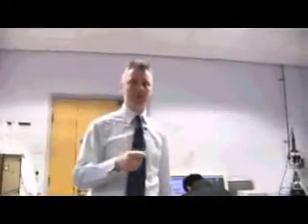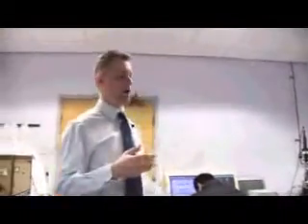Okay. Where are we now? So basically in one of our atomic force microscopy labs, and this is a special tool that we're particularly good at here, that allows us to visualise nano-sized objects. And very importantly for us, it allows us to image them in liquids and biological environments. So when we're working to develop new medicines or new implants, we can actually look at those materials in the right environment. And that's a core skill that we have here.